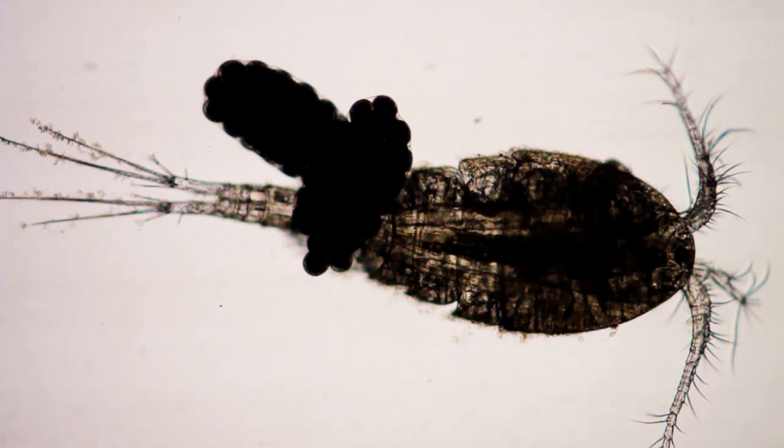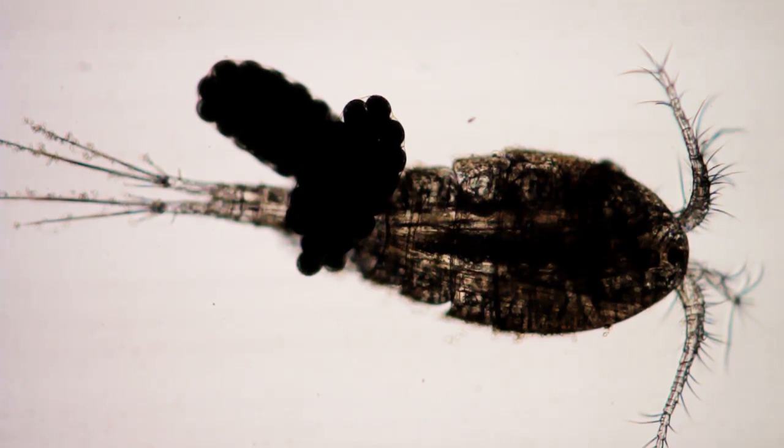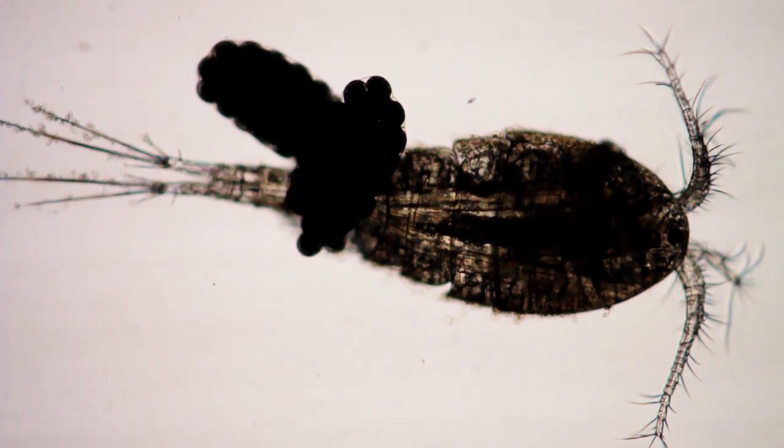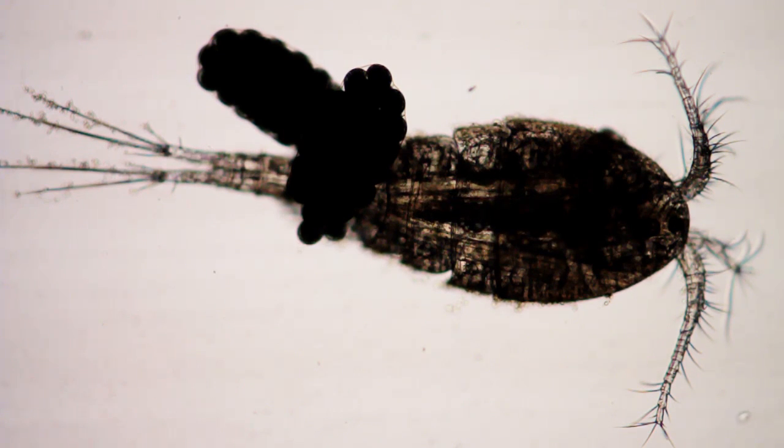This is an adult female cyclops with egg sacs. She's very much alive. I have her on a depressed slide — a slide with a depression in it and a cover slip over it. She's in water. I think the slide is just touching her enough that she can't move. I've seen her wiggle.